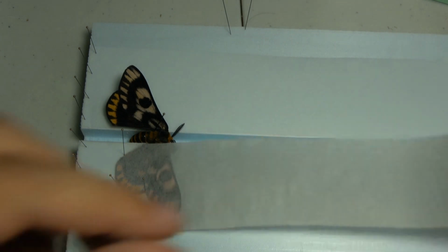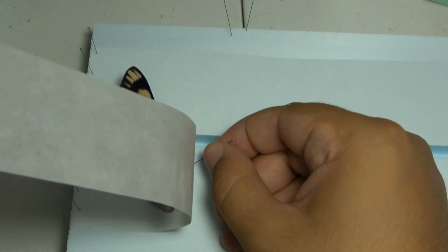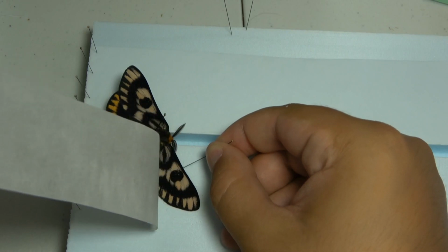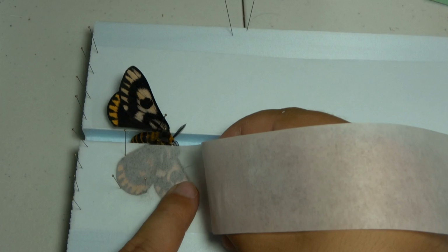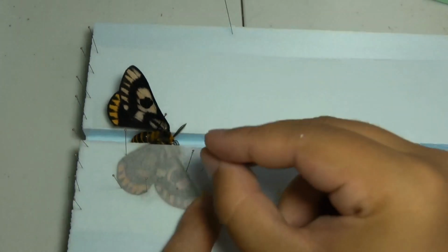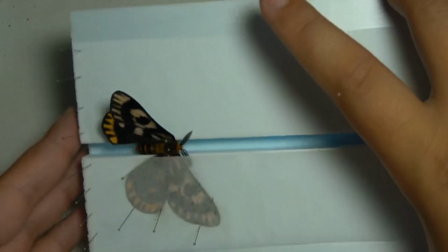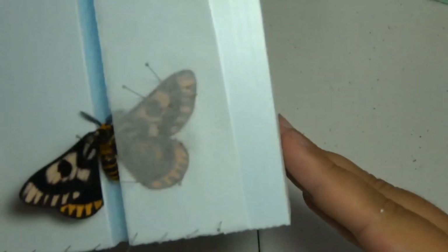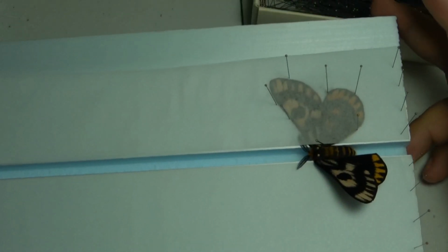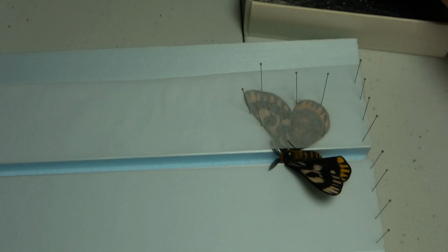Then next, lift up the paper again. Then I position the forewing where I want it. Then hold the paper down tightly, my finger again, and place pins. So, just like that, you have one side of the specimen pinned. And now it's the other side. The process is going to be the exact same.